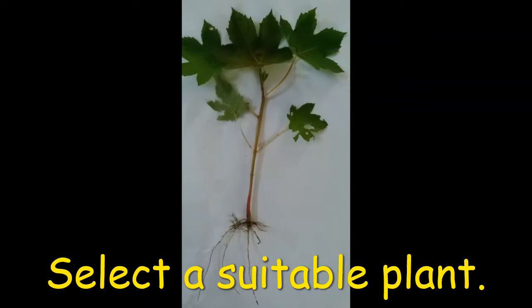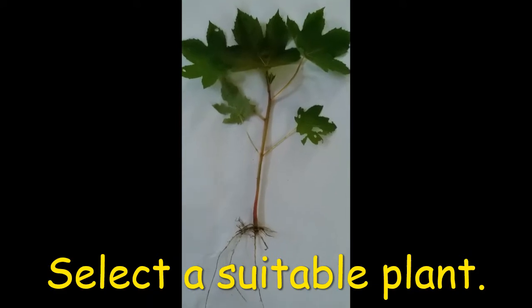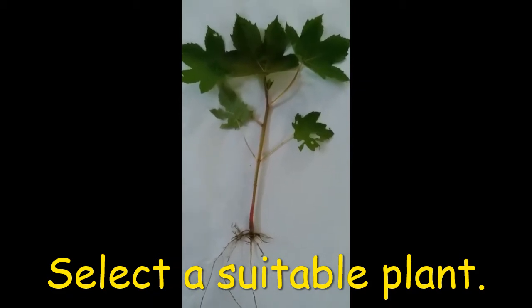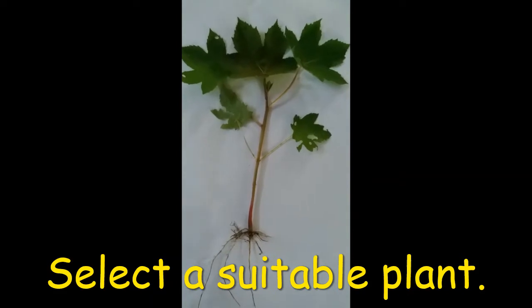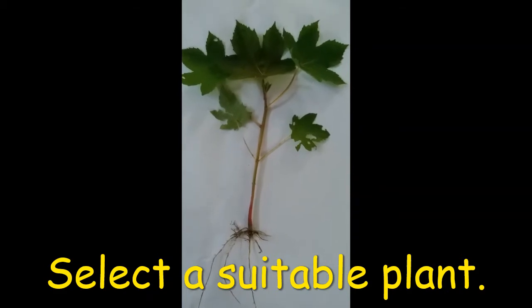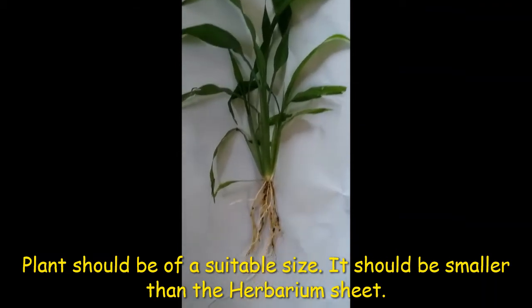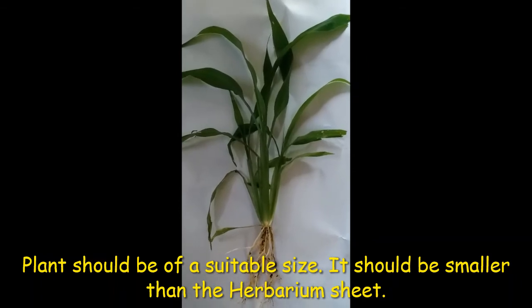To make a herbarium, first select a suitable plant. Make sure that all its parts are present and the plant is clean and dry. For example, this is a small plant of castor, Ricinus communis — all its parts are intact from root to shoot. This is grass; here also you can see all its parts are intact: the fibrous roots and the bunch of leaves at the top.